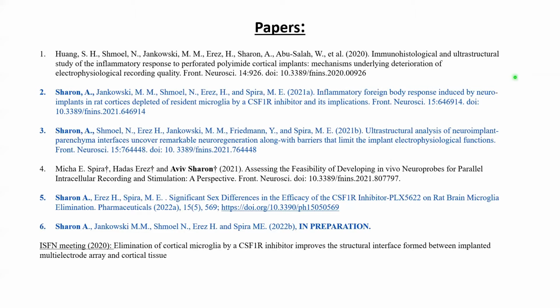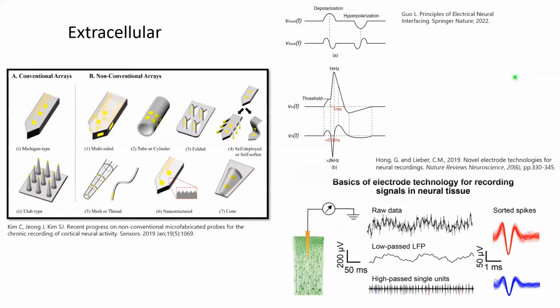To clarify the motivation of the study, I will start with some background. Among many tool types developed to investigate the brain, electrophysiology holds the most suitable spatiotemporal resolution. In the single to tens of neurons scale, the most commonly used technology to record electrophysiological signals from the live brain is the multi-electrode arrays, for short MEA. You can see here some examples for the standard MEAs that were developed over the years. These MEA were developed to enable long-term multi-site parallel recordings from hundreds to thousands of neurons.